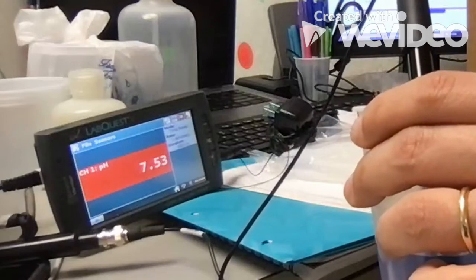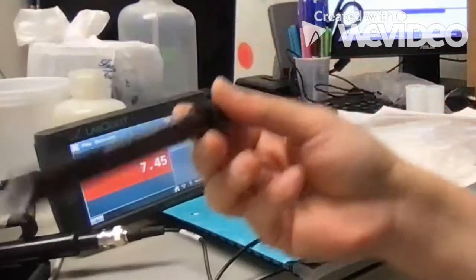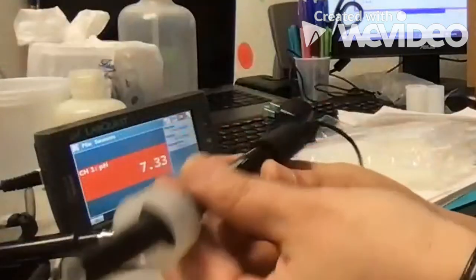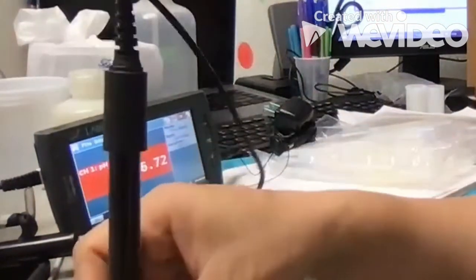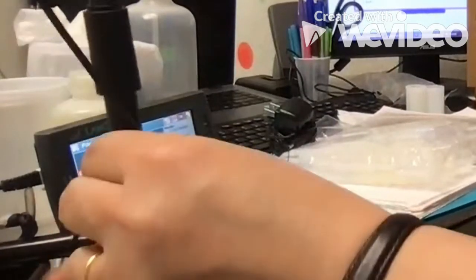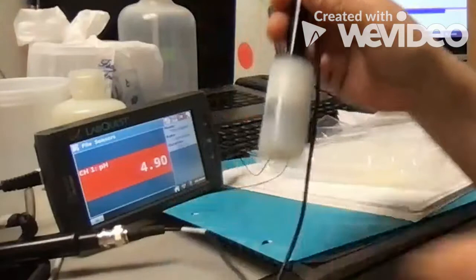Okay, 7.53. I think the ammonia probably lost some oomph over time. Probably some of the ammonia evaporated, and so it's not as basic as it should be. Earlier, we were getting a pH of about 10, so just keep that in mind. But you should record what you saw there.